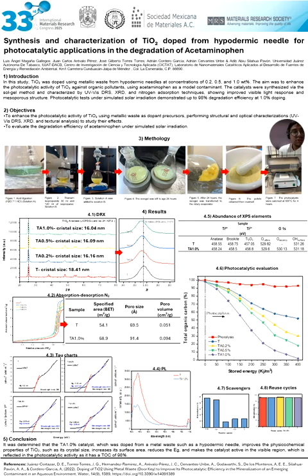So the main objective of this work was to improve the photocatalytic activity of TiO₂ using a metal waste like hypodermic needles as a doping precursor to remove organic pollutants, using acetaminophen as a model of contamination.